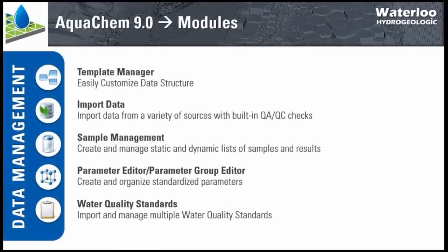In terms of data management, we have a template manager that allows you to easily customize your data structure and also put some constraints on it. We also have the ability to import data sets from a variety of sources and then manage your samples, edit your parameters, and also create lists of parameter groups, and then import and manage water quality standards.